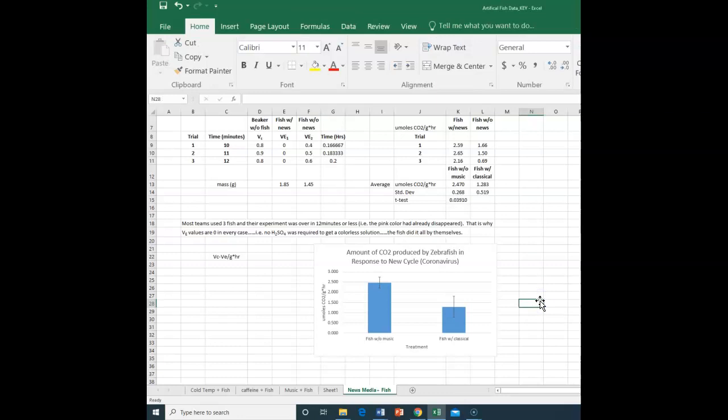All right, so hopefully that was helpful. I hope that was helpful, and I look forward to seeing your analyzed data, not on this one, but on the ones that you picked.